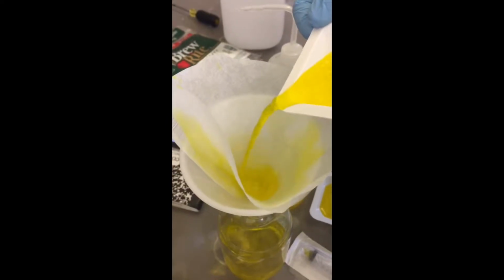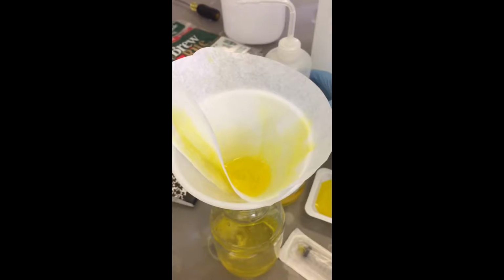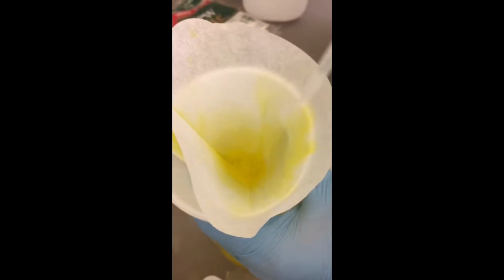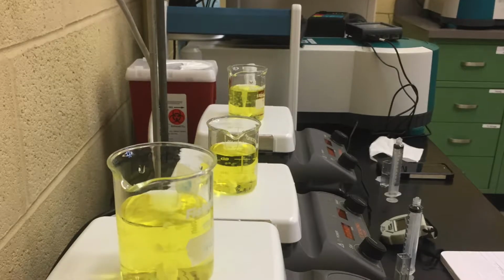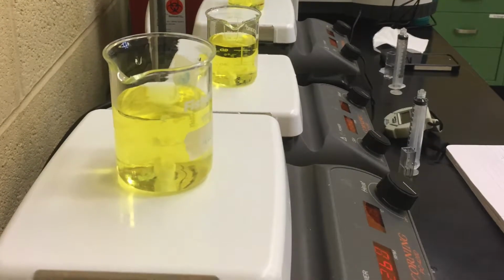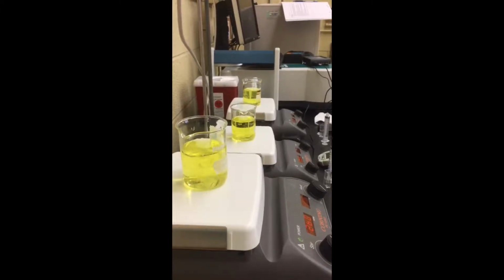At the end of the 5 minutes, the solution was poured through filter paper and the beads were rinsed with deionized water to ensure that the beads were separated from the remaining solution. At this point, the beads were ready to use. Once the beads were created, they were added to 100 milliliters of deionized water that was being mixed on a stir plate at a set speed. As soon as the beads were added, a timer was started.